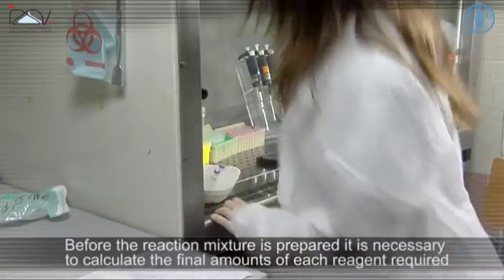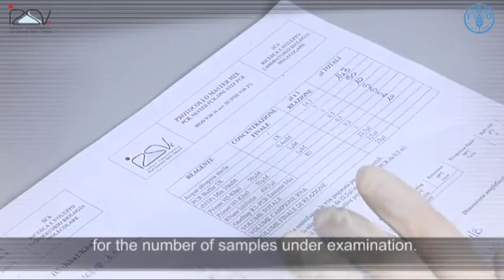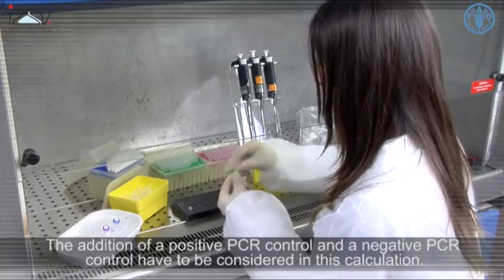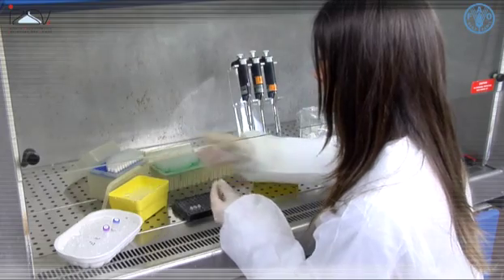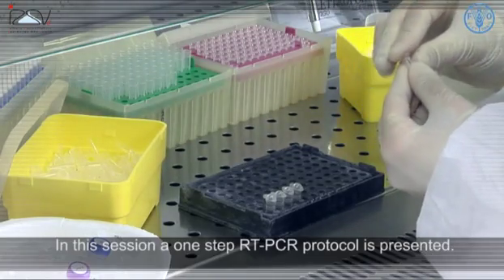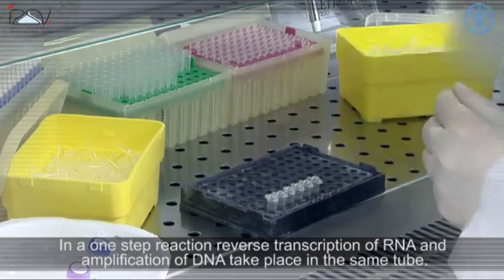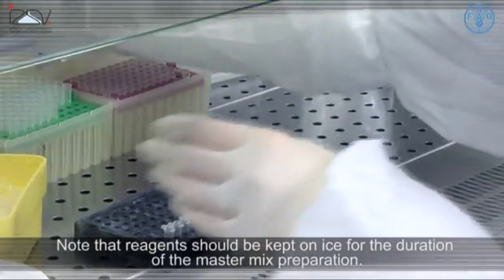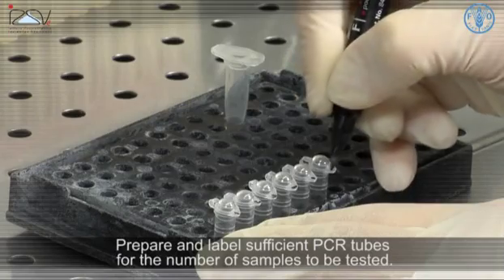Before the reaction mixture is prepared, it is necessary to calculate the final amounts of each reagent required for the number of samples under examination. The addition of a positive PCR control and a negative PCR control must be considered in this calculation. In this session, a one-step RT-PCR protocol is presented. In a one-step reaction, reverse transcription of RNA and amplification of DNA take place in the same tube. Note that reagents should be kept on ice for the duration of the master mix preparation. Prepare and label sufficient PCR tubes for the number of samples to be tested.